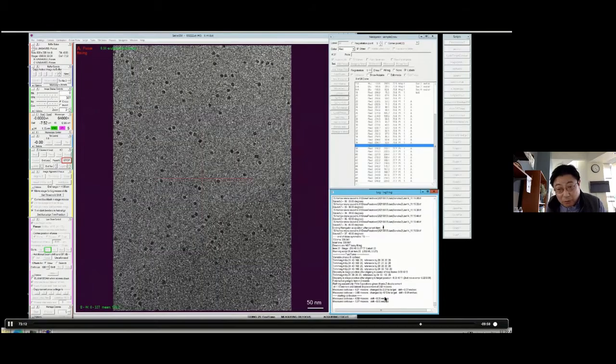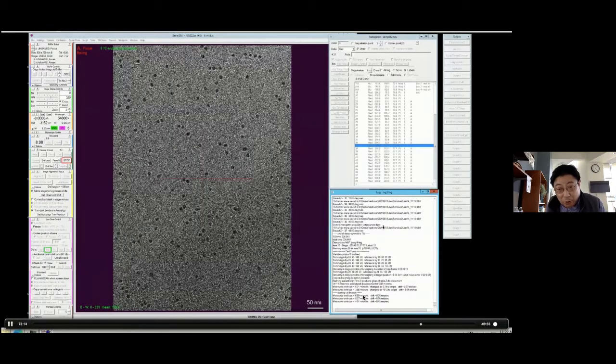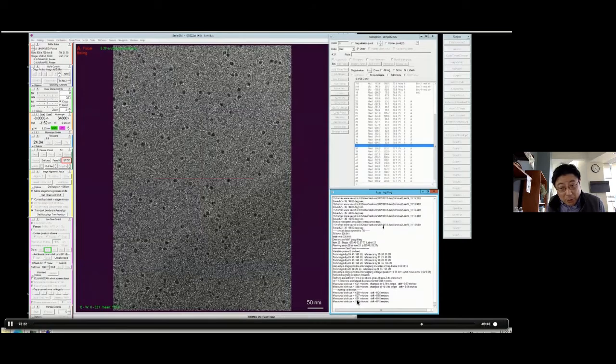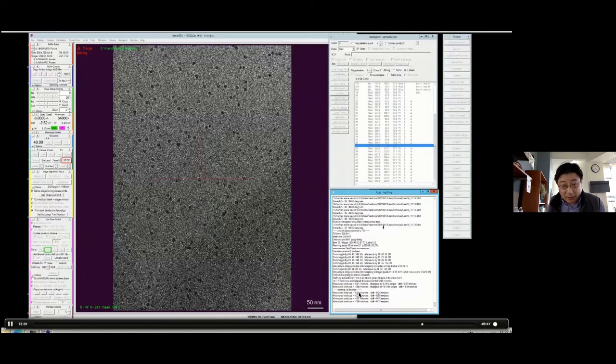Okay, here is what I forgot. This one is basically doing focus calibration. In other words, it uses minus 40, minus 20, 0, plus 20, 40 to do the method. When you tilt, you find your defocus, and these five tilt angles have different defocus. So that's one reason we have to do autofocus.